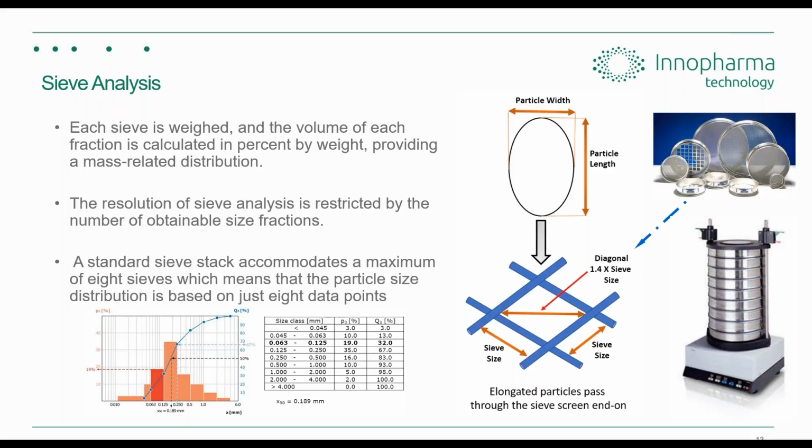So essentially how sieve analysis works is you have a stack of sieves. You can only stack that so high, maybe about 8 or 10 sieves high. And all those sieves will have different meshes, these blue lines that you're seeing on the right, showing different apertures that particles can fall through. And what's left behind essentially is that particle size and above on that sieve. So I call it binning.